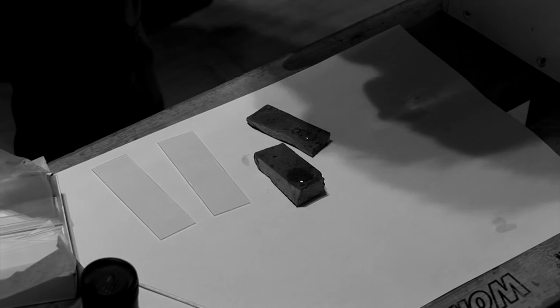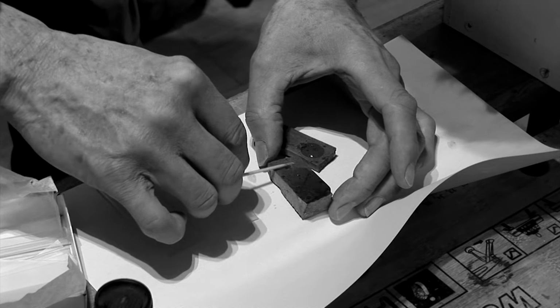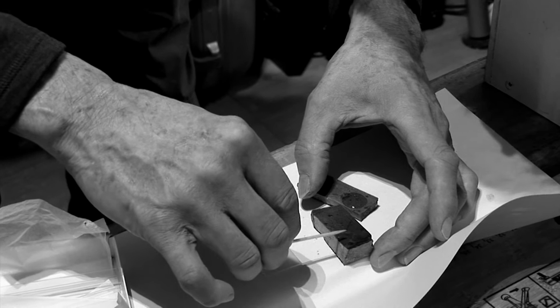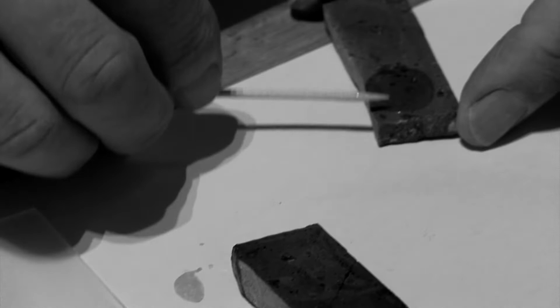So you flood that on, and in some rocks you get lots of little pores, little vesicles where gas has been while the rock was hot, and so it leaves little bubbles in the rock. So you need this to flood in and go in there. And this piece has got a little crack in it, so I want it to go in the crack a bit and support it, because after it's stuck to the glass, I've got to thin it again, but this time get it down to about a millimeter thick.